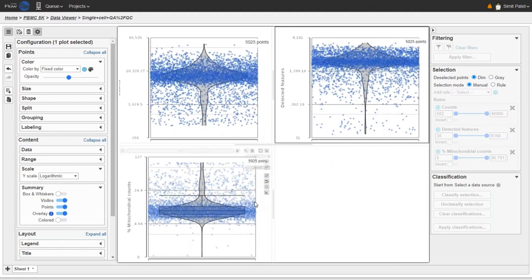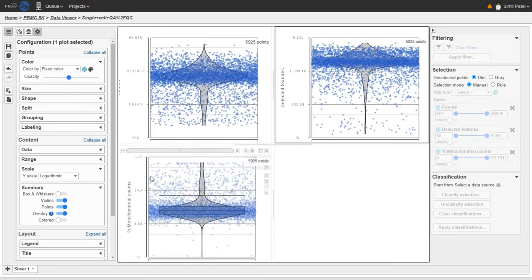The percentage of mitochondrial counts plot is useful for filtering out damaged or broken cells. These cells typically have a higher percentage of mitochondrial counts compared to intact cells, although this can vary depending on the type of tissue. If you're working with a metabolically active tissue like kidney, for example, you might expect a higher percentage of mitochondrial counts. For a PBMC sample like this, cells in the higher part of this distribution are likely to be damaged or broken.